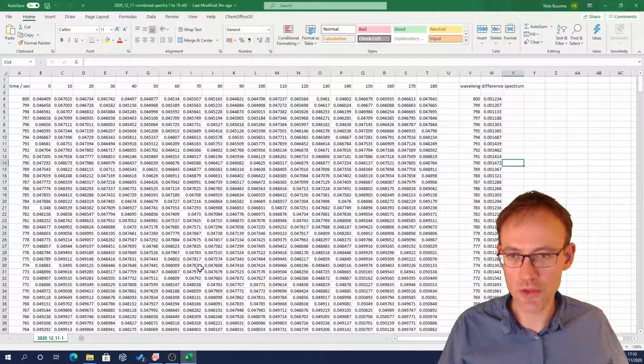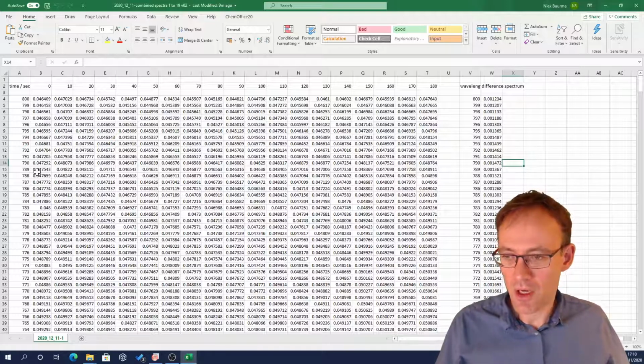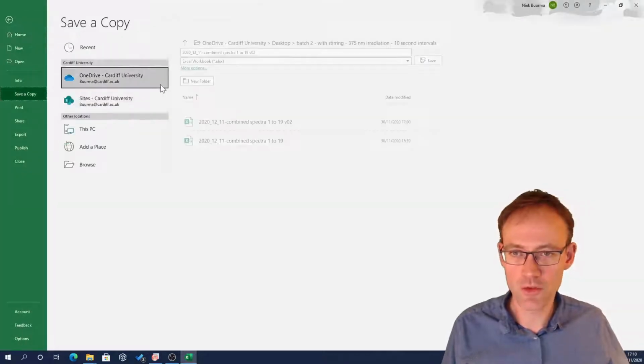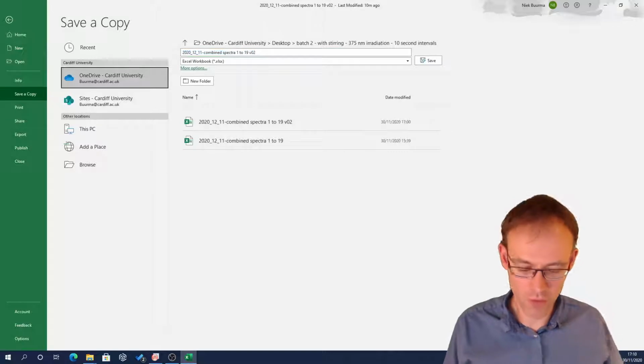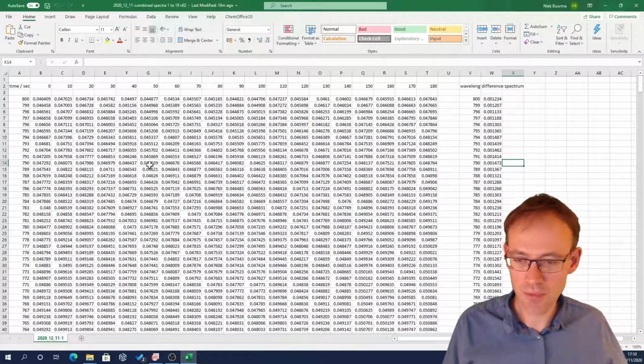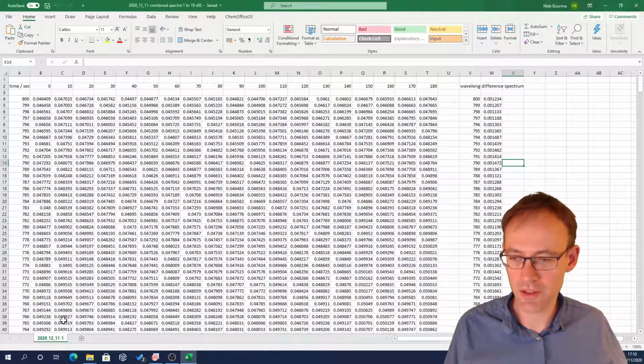So what I'm going to do is show you how you can get those data in a convenient format so that you can plot those time traces. Again, to make all of this traceable, I'm going to save a new version of this file. It's version 3 by now. And I am now going to extract my kinetic traces.